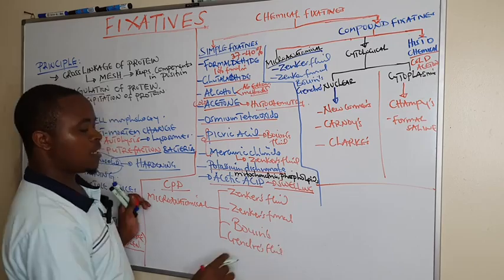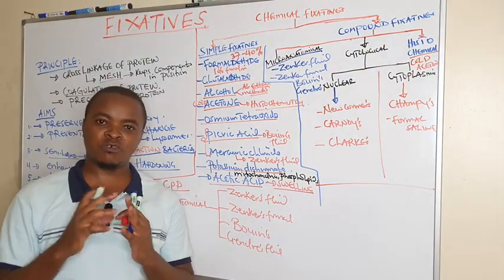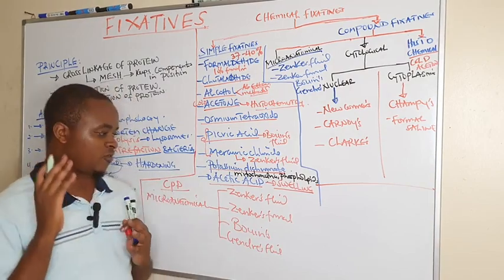All of these act by preserving the anatomy or the structural morphology of cells.